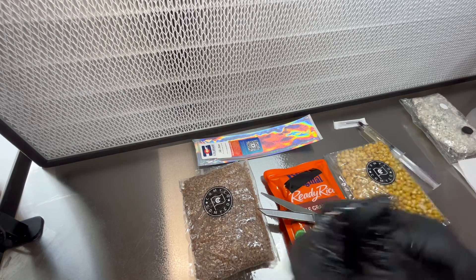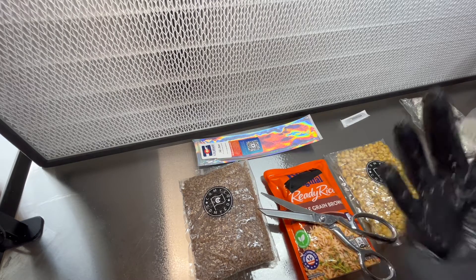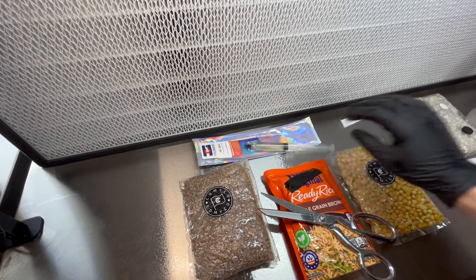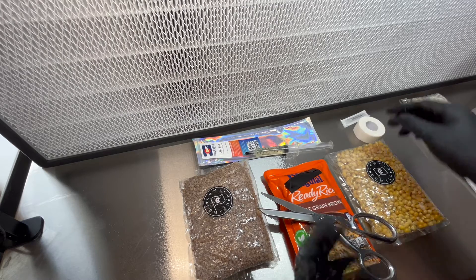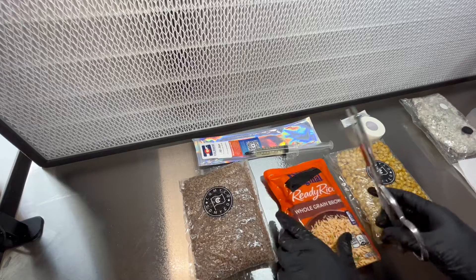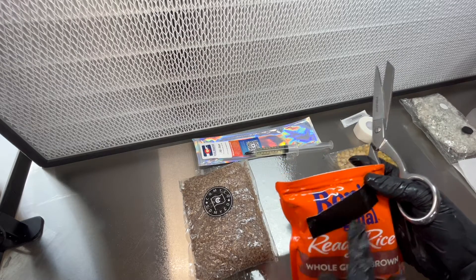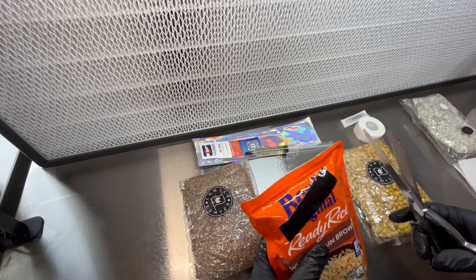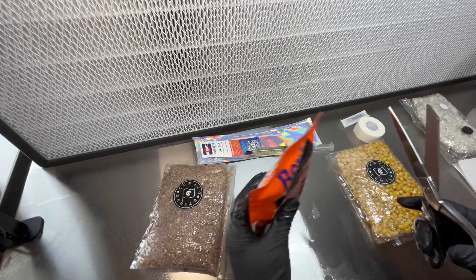We're going to inoculate it with some of this Ski Bum from Colorado Cultures. I will show you guys how this is done. Make sure I've got the micropore tape here close by. This piece of tape is just so I don't get in trouble — I just wanted to cover the logo. But yeah, this is the precarious part, so I'm not going to talk. I'm just going to do it real quick.